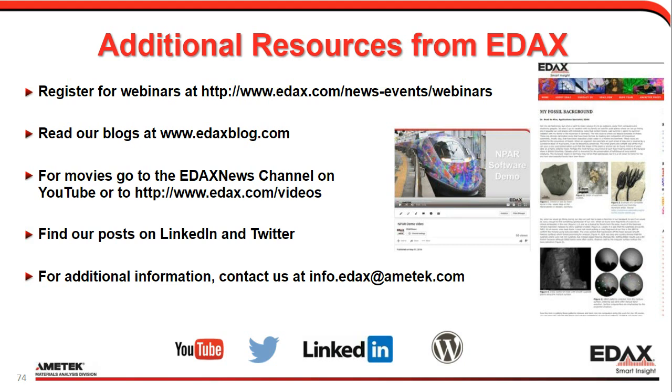And on the NLPAR method, there's a question on how do you define K, and what are the parameters which should be taken into account to determine it. It really is going to have to be an iterative experimental thing. Obviously, the smaller k is, the faster it will go, so I would start small, maybe start with 3, go to 4 and 5 after that, and see if it improves it. There will be a point where it will drop off. You can use a very large one, but you will have to be patient. It does take some time.